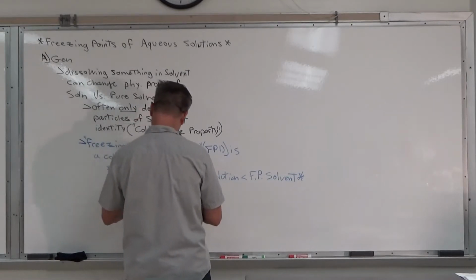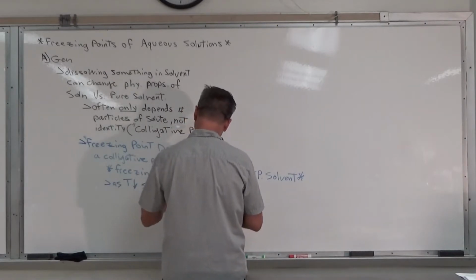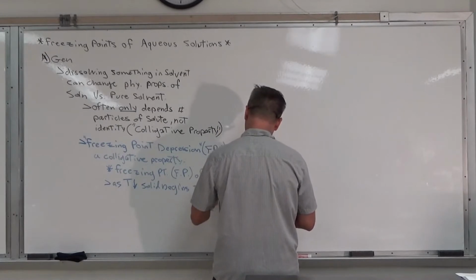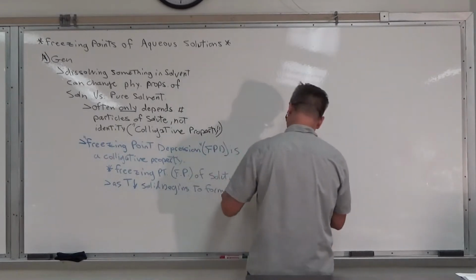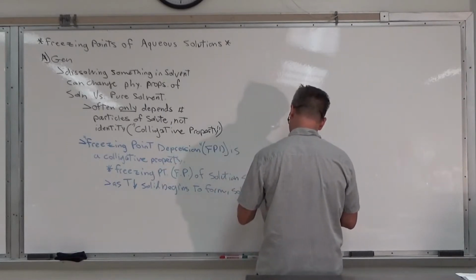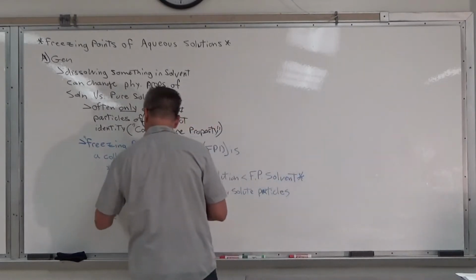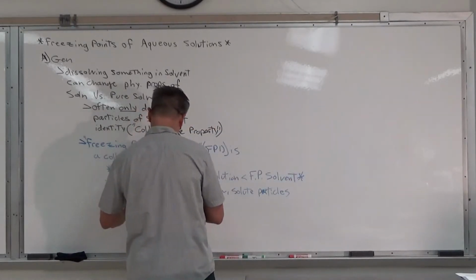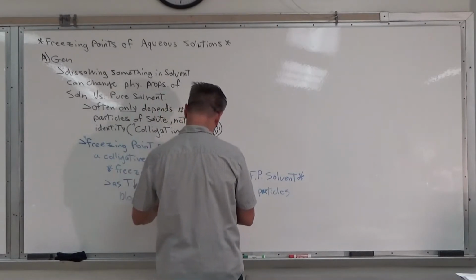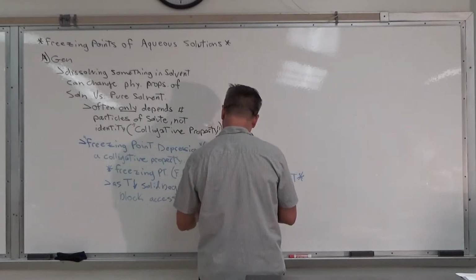As the temp falls, solid begins to form, and solute particles block access to the forming crystal.